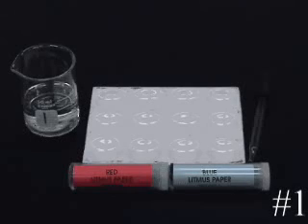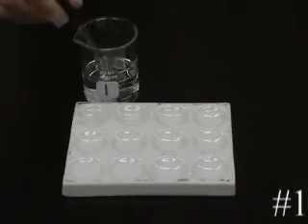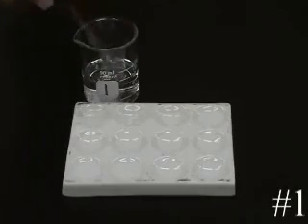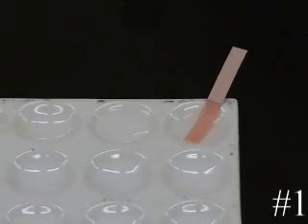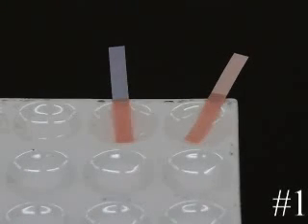One simple test is to identify the solution as acidic, basic or neutral. For this test we will use red litmus paper and blue litmus paper. Place 5 drops of the solution into each of 2 sections on the drop plate. Place a piece of red litmus paper in one section and blue litmus paper in the other. Record your observations in the data table.